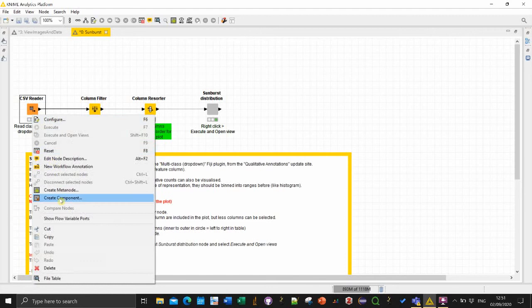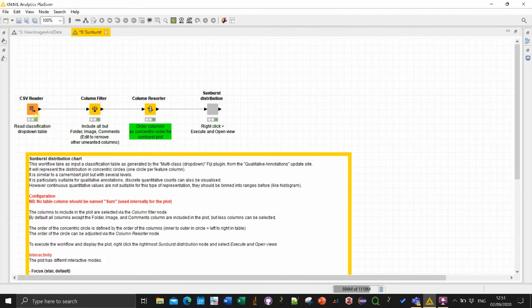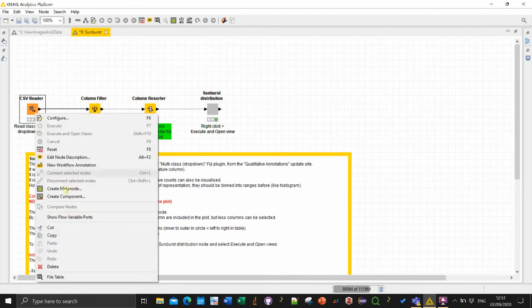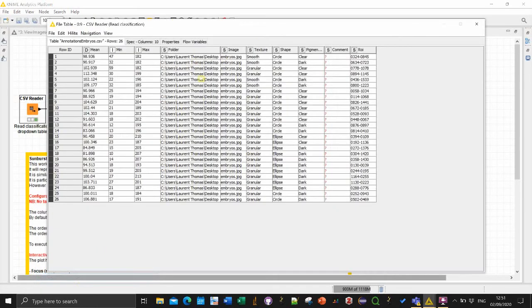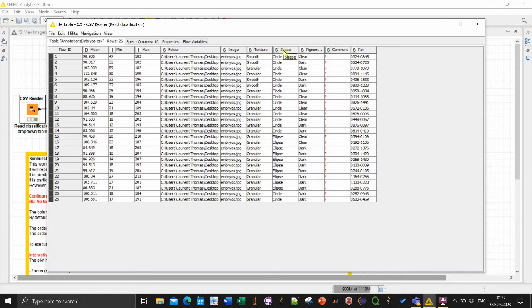So again we just load here the table. In this case though we expect a table with a specific formatting. Especially you should have used the plugin with the drop-down menu because we expect one column per feature. So here we have three features texture shape and pigmentation which were describing those embryo.